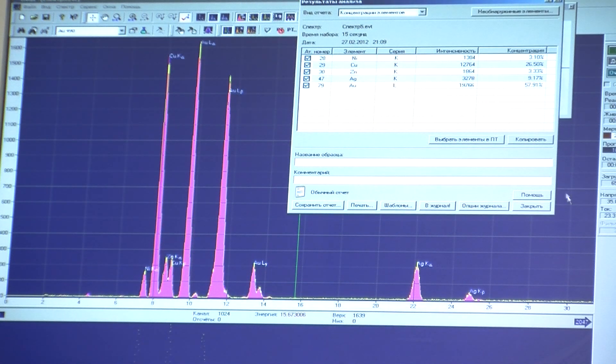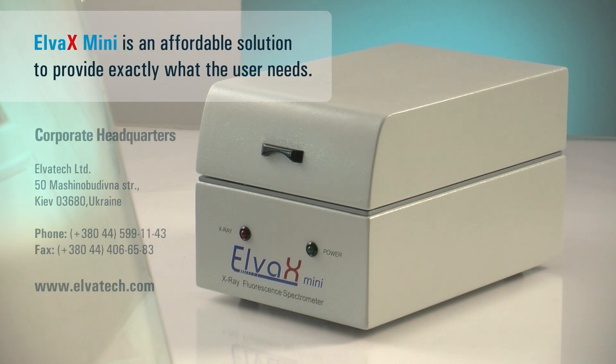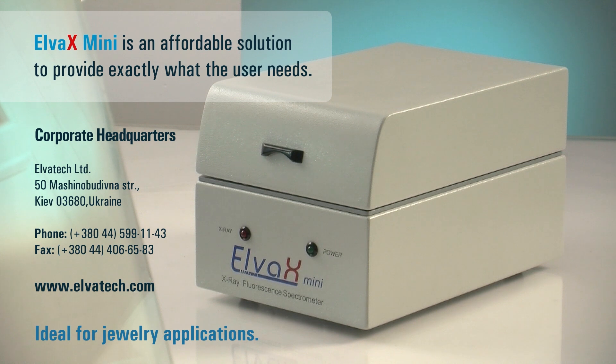The instrument can be easily pre-calibrated for measurement of different materials. Elva X-Mini is an affordable and efficient solution in precious metals analysis, which is ideal for jewelry shops, banks, and assay offices.